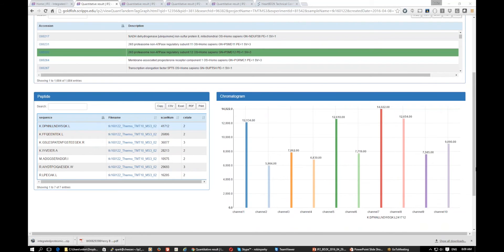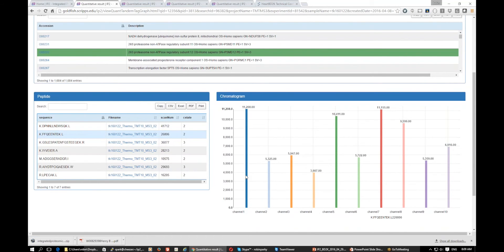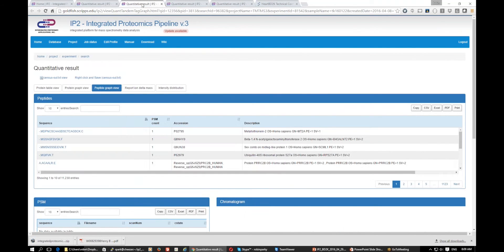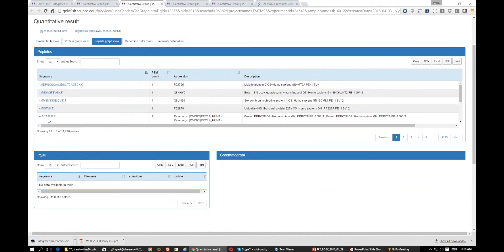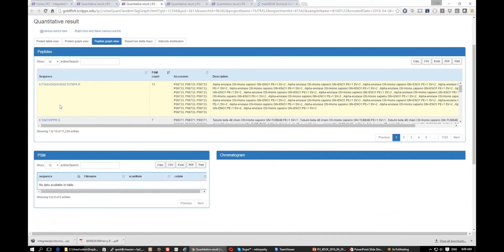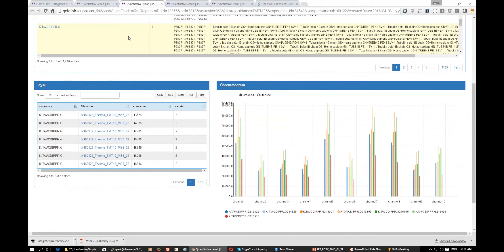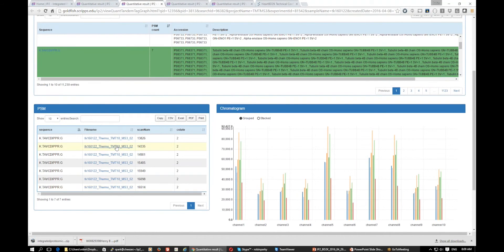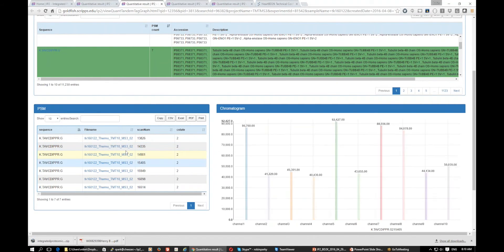This is a 10-plex TMT example analyzed on the Fusion. You can also look at the peptide graph view. Each peptide can have more than one scan. This one peptide has multiple spectra matched to it — they all have the same sequence but different scans — and you can look at individual ones as well.